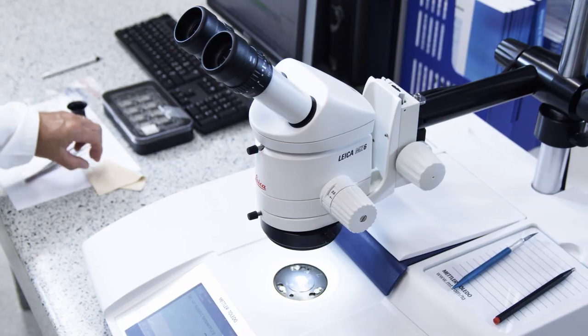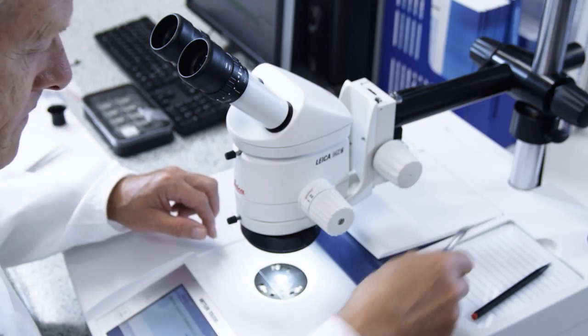In a Flash DSC measurement, the sample is placed directly onto the replaceable sensor.